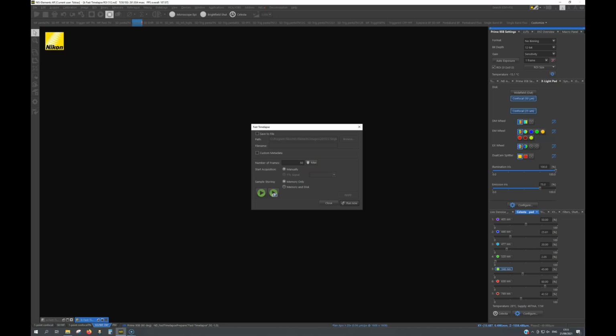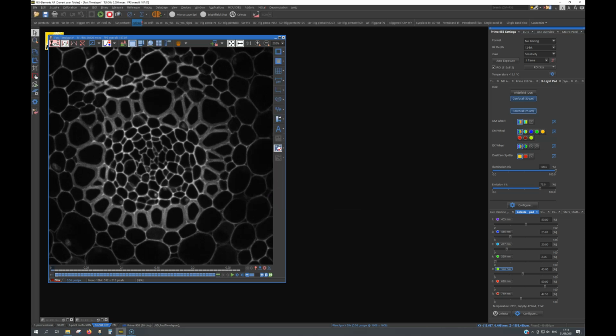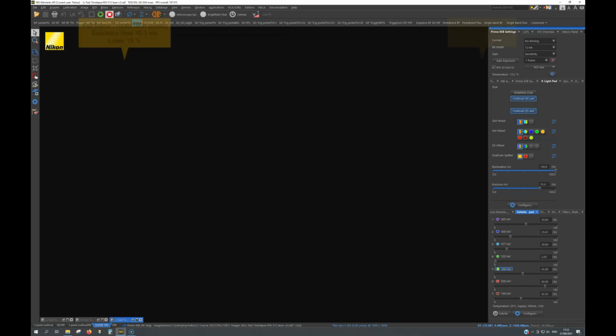The only change we've done to the imaging settings is to increase the laser intensity to 45%. The frame time for an image is the same 5.3 milliseconds as for our previous region of interest image acquisition. But using 3 times the laser power, 45% instead of 15%, has reduced the graininess of the image. To see that, we need to compare the images we have acquired.